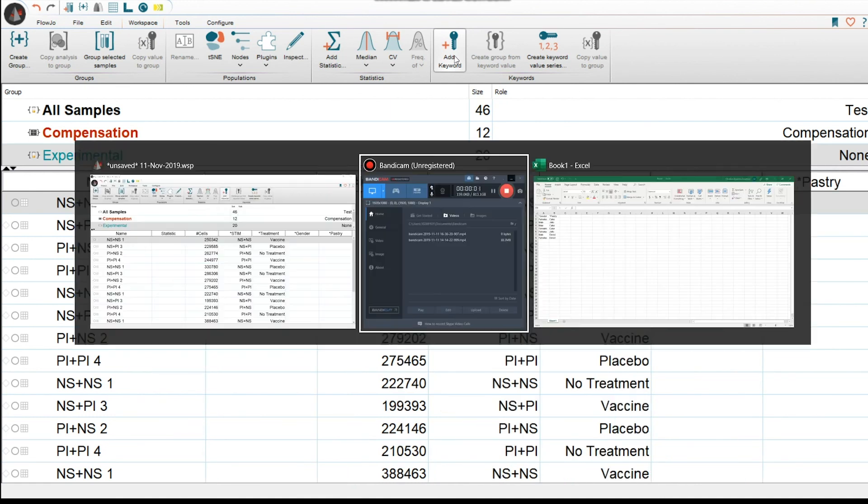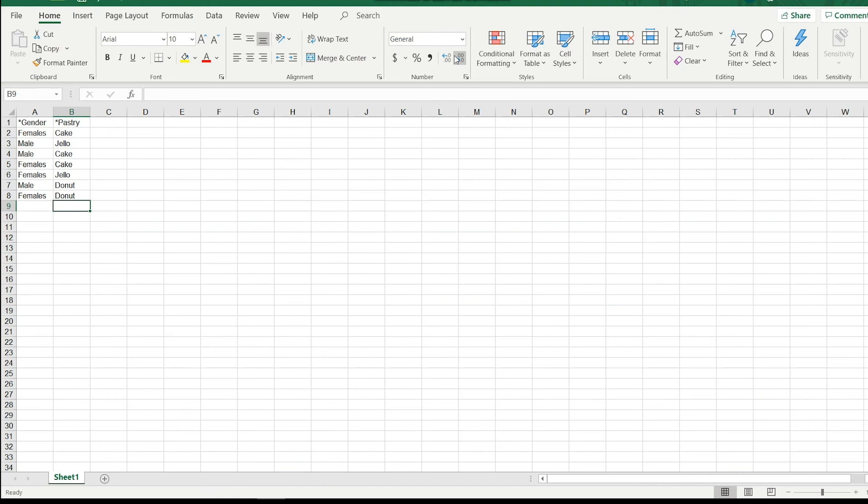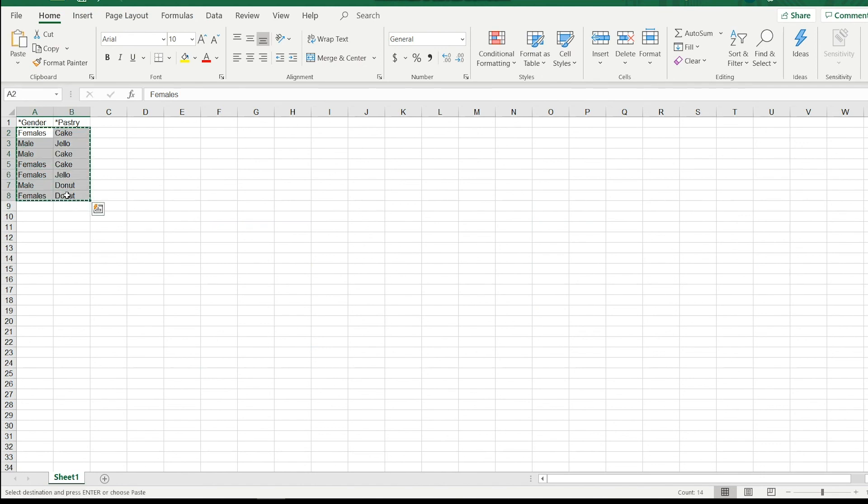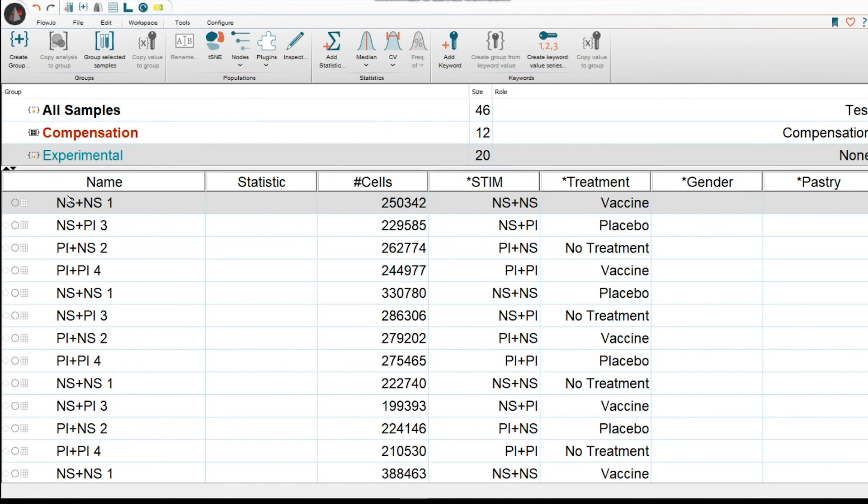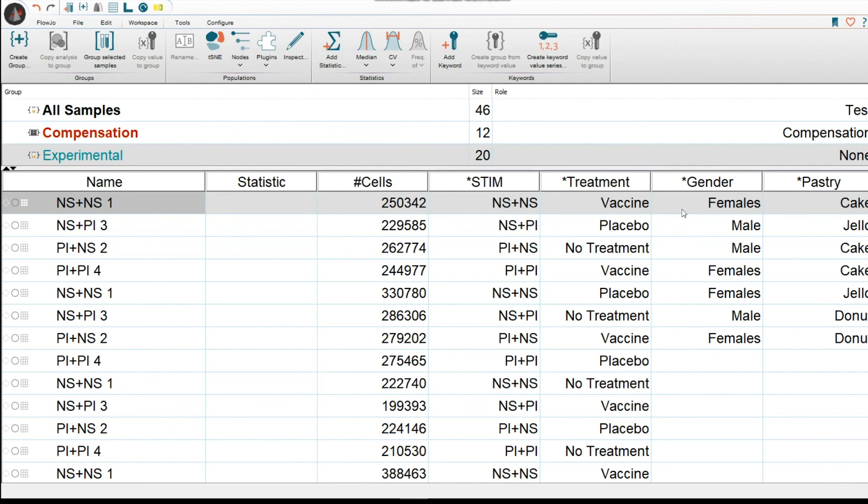Then we're going to open up our Excel spreadsheet. And we're going to go ahead and select the keywords that we're going to be transferring. Copy them. Go back to our workspace. And then you would just select it where you want to add it. And then you Ctrl-Paste. And there you go. You very quickly have transferred your keywords from your Excel file to your workspace.